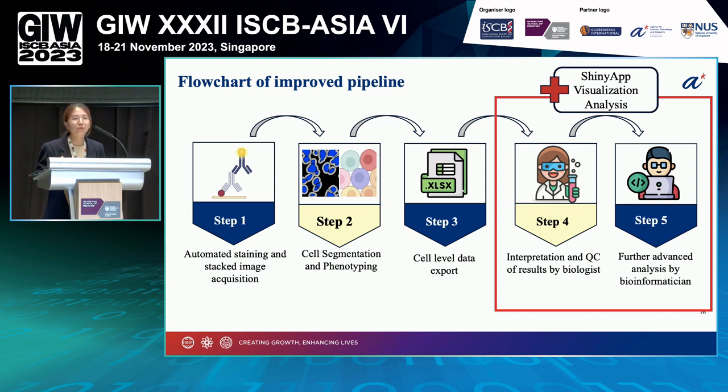So what we can do is run a pilot run first of, let's say, 5 samples, and test it out to make sure the data makes sense and matches back. Then we can run the whole cohort and pass it to the bioinformatician downstream to do further analysis.